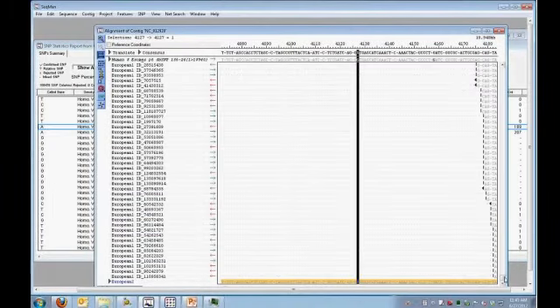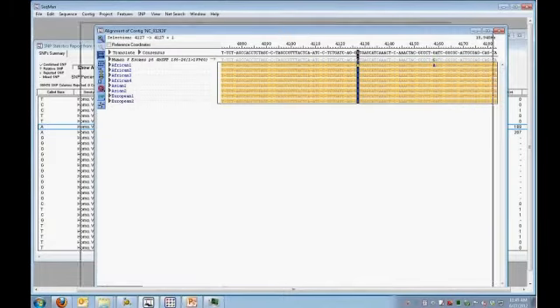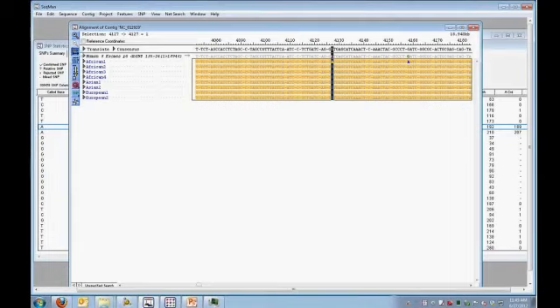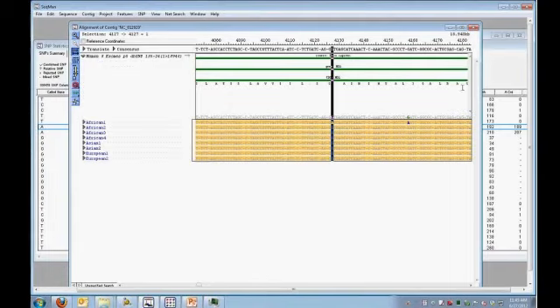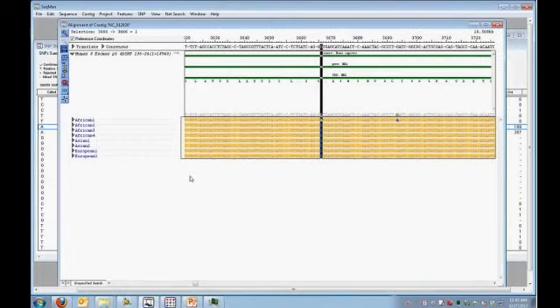And the alignment view then, and these are really deep exomes, so you can see in this alignment view, I can collapse everything down. I can expand, so if I click this top, I'll call it a twisty triangle for lack of a better term. Here's my reference sequence, and I can see the annotations in my reference sequence. Here's a consensus at the top. I can convert to reference coordinates by clicking this box rather than the consensus. So it's a really nice, powerful view for analyzing a project like this.